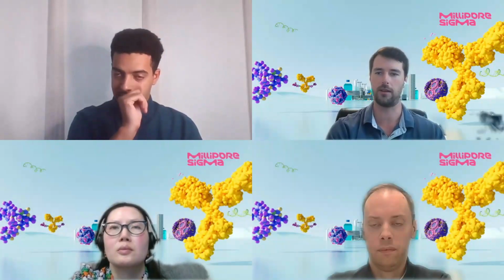So for the 8-second integration time, that's just one 8-second scan per measurement. And then we also did 4 seconds, which only focuses on the higher range. At 4 seconds, we weren't worried about the lower concentrations that would provide too little signal, and we were still able to generate a strong enough signal and good model evaluation results with a lower integration time.